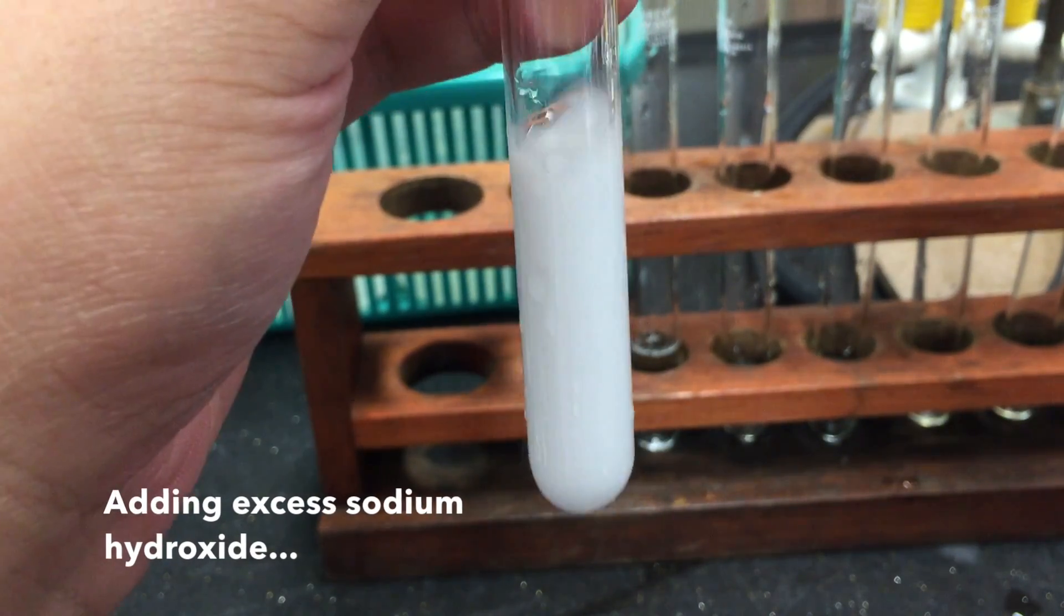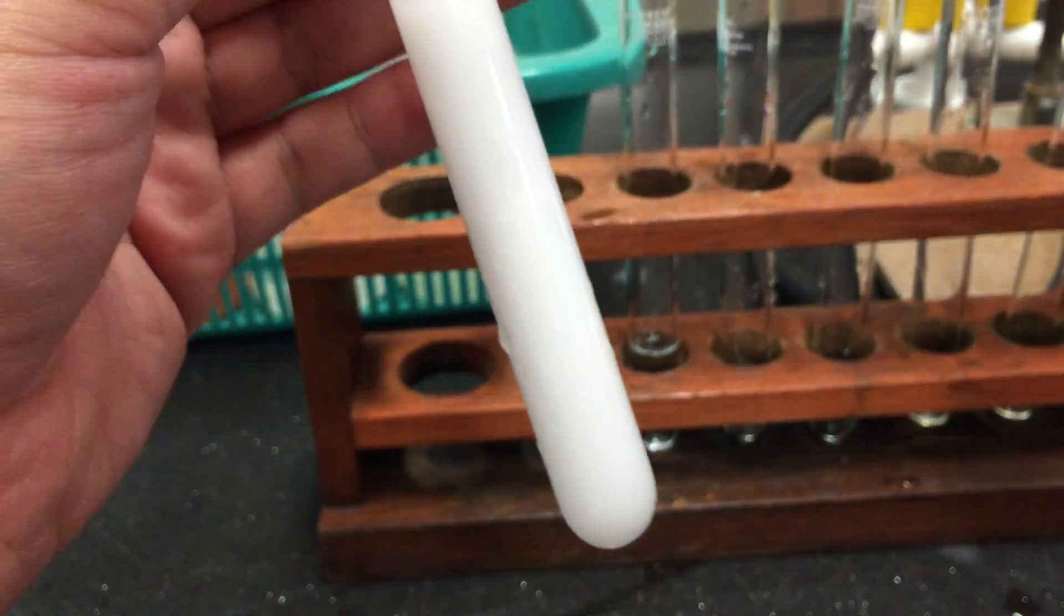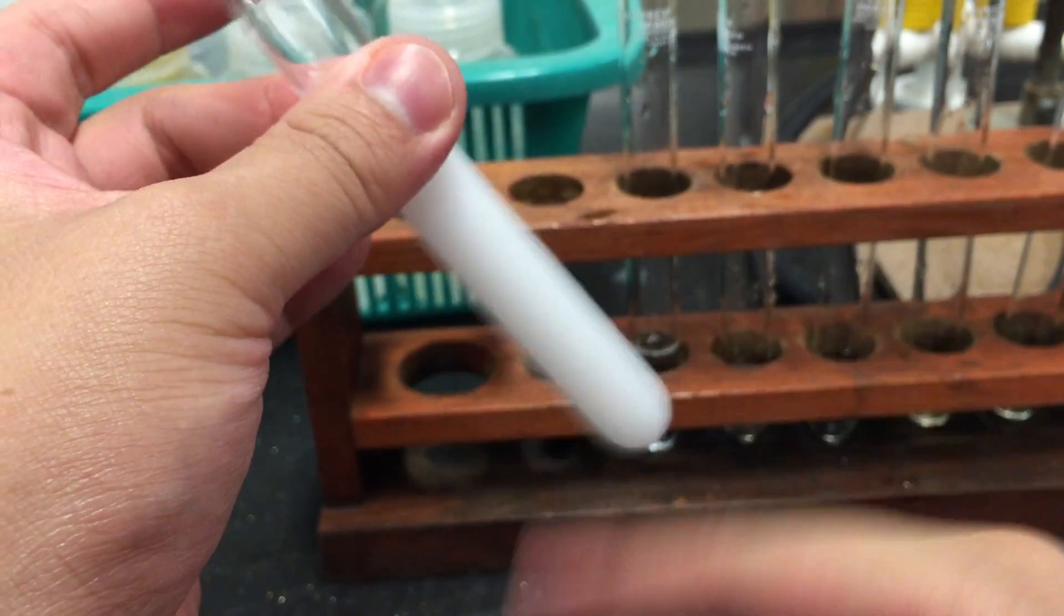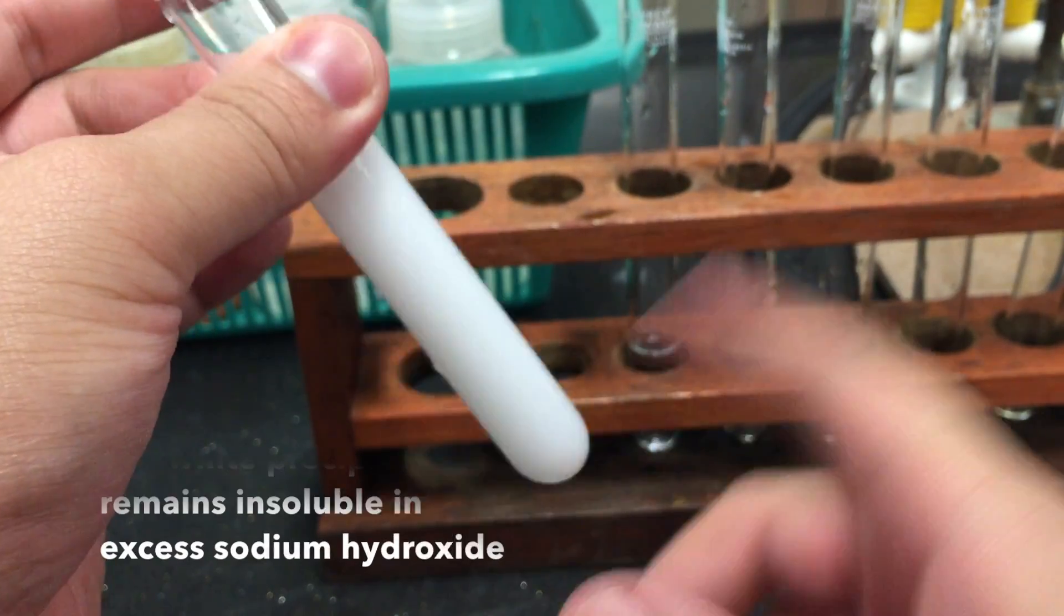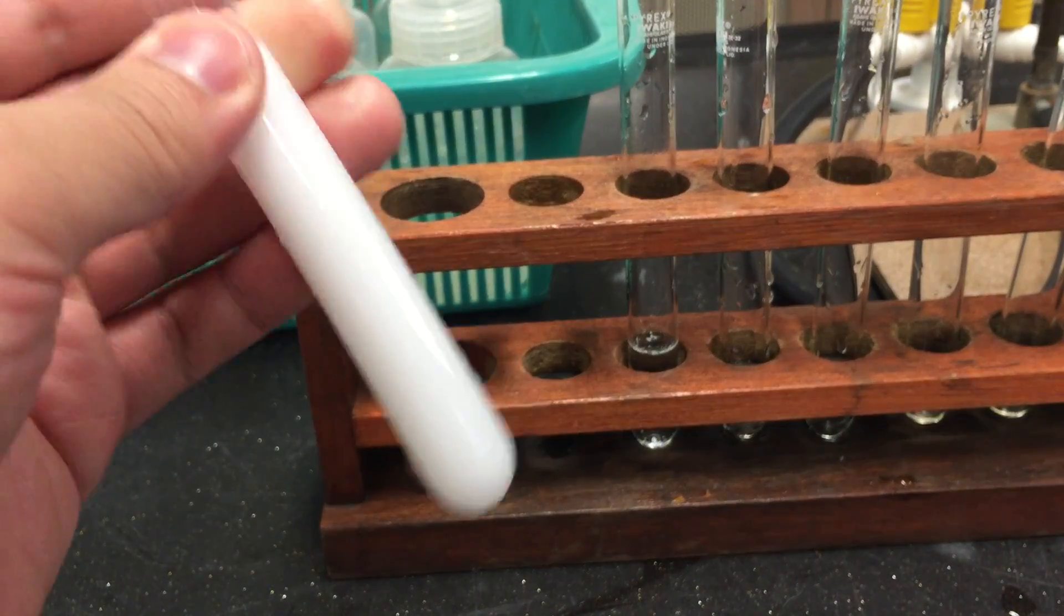Proceed to add an excess of sodium hydroxide. Notice that the white precipitate remains insoluble in excess sodium hydroxide.